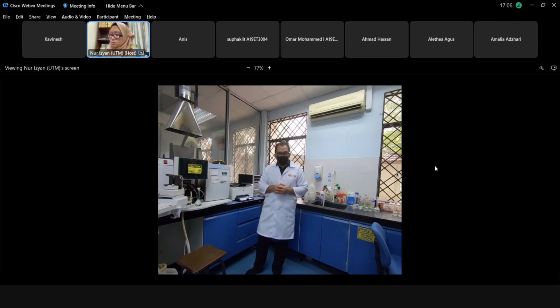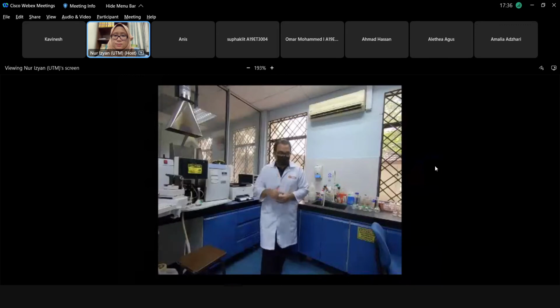Quantitative analysis requires accurate and reliable measurements that relate to the composition of the sample. In instrumental techniques, the proportionalities need to be practically established in the calibration procedures. In a typical simple calibration, a range of standards is prepared containing varying amounts of the analyte. So now we are going to use this technique to determine zinc in our sample using AAS.